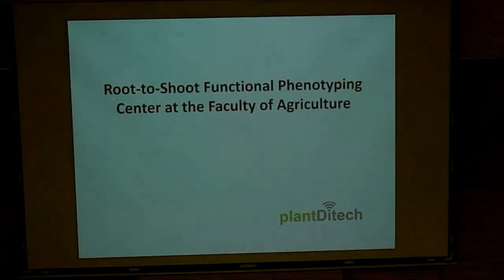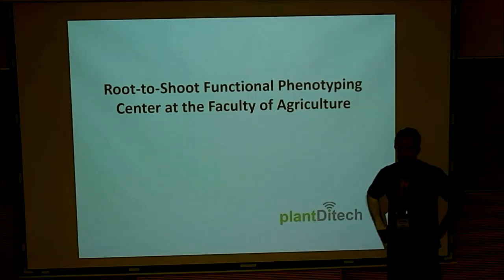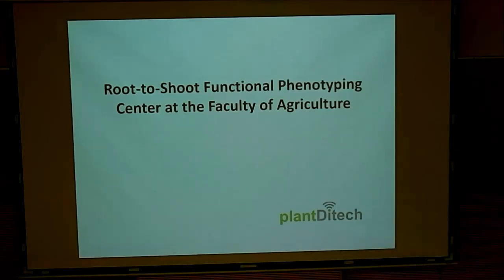So good morning again. We will see today our phenotyping center, what we call functional phenotyping, which means we don't use or almost do not use cameras. We mainly use probes and sensors to sense the whole plant-water relations. So I will give you some ideas about what you're going to see. If you have questions, we have a long drive back, so we can talk about it.